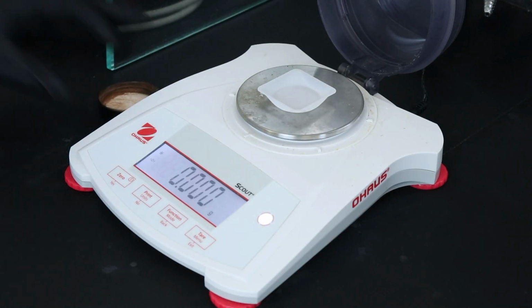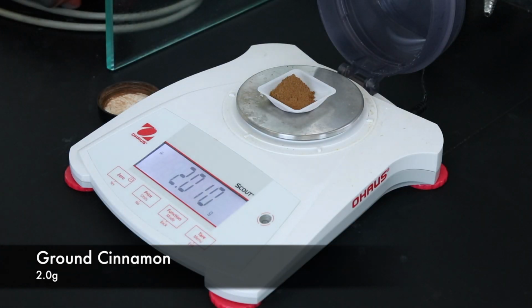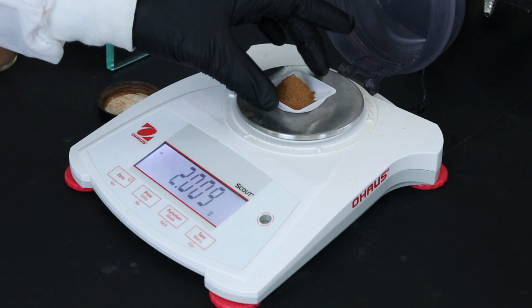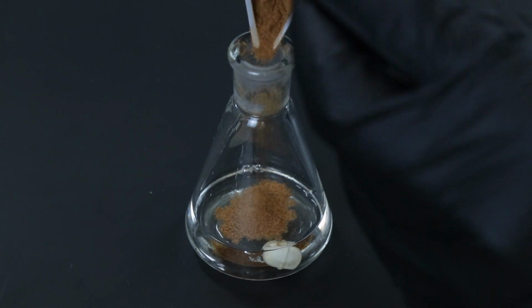Now I'll weigh out about 2 grams of the ground cinnamon, noting exactly how much is weighed so a percent recovery can later be calculated. And I'll just add that on top of the water in the flask.